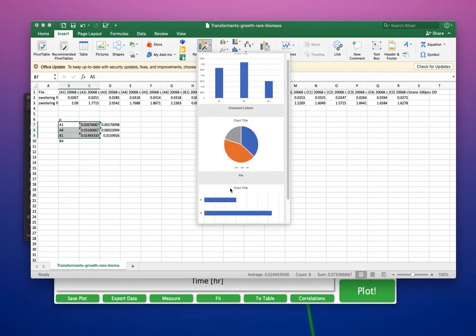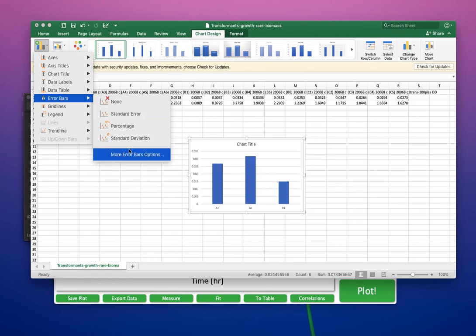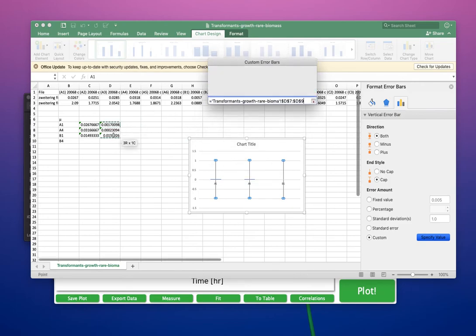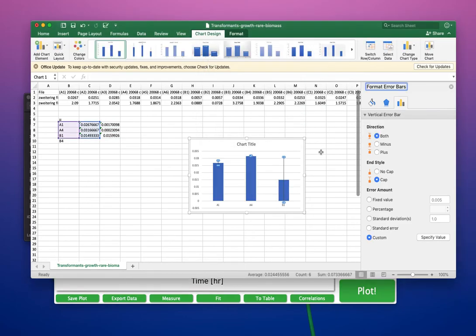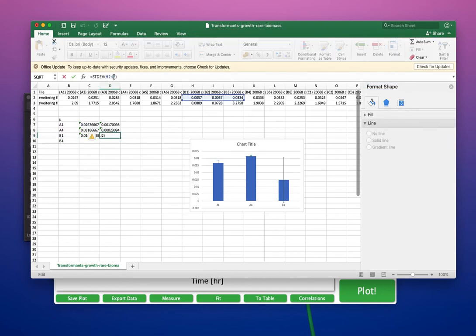You know how to plot in Excel. And then what's nice is you can then do t-tests. Ooh, I put in the wrong error bars there, did I? That's strange. Oh, weird, okay. Very big difference in growth rate. You can then do your t-tests basically.